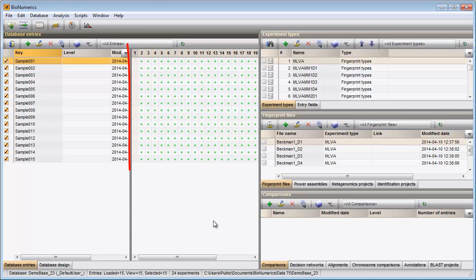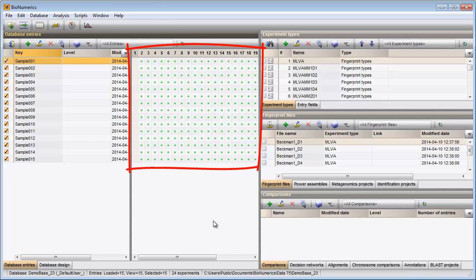In the main window, we can see that all entries now have experimental data for all newly created fingerprint type experiments.